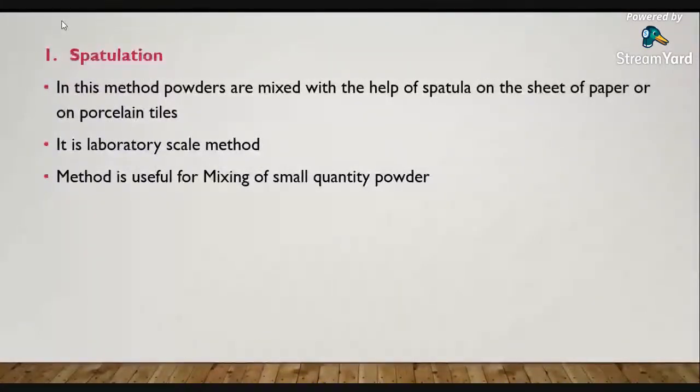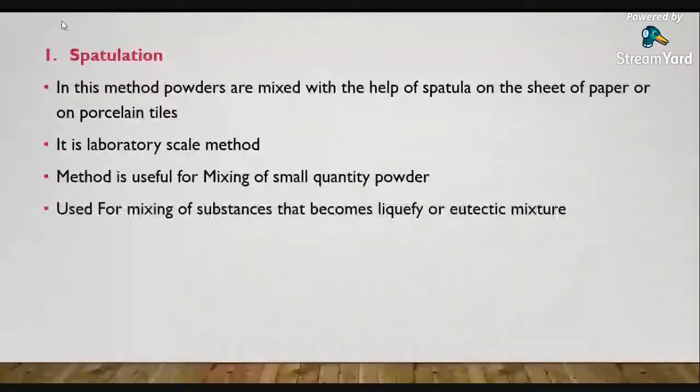And it is not useful for mixing of large size powder. Now, in this case, whatever the ingredients we are mixing, that may be hygroscopic, deliquescent, or eutectic mixtures. Now, what are the eutectics? We have already seen. But here eutectic means a mixture of substances like menthol, thymol, camphor, and such a mixture is known as a eutectic mixture.